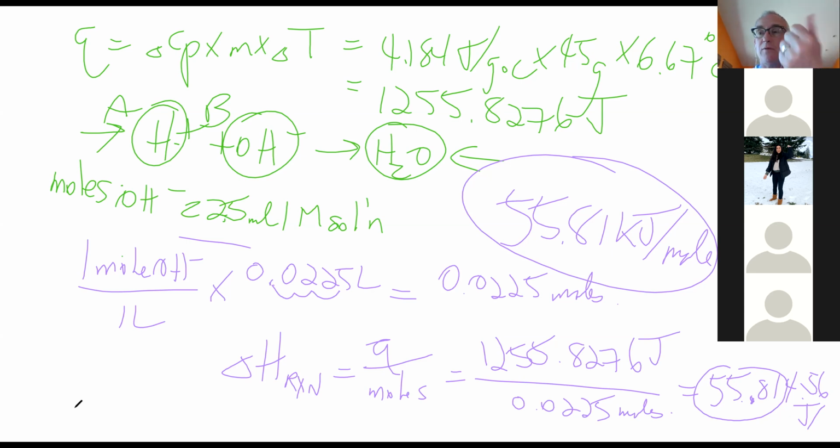So what we're looking for is we want you to do these reactions twice, once with a smaller amount and once with a larger amount. So I don't think you want to go much past a gram of NaOH. If you use more than a gram of NaOH, you're going to need more HCl to react with it, more than 50 mils. Just remember that. You can use more, just use more than 50 mils of HCl to neutralize it. Or calculate which one's the limiting reagent.